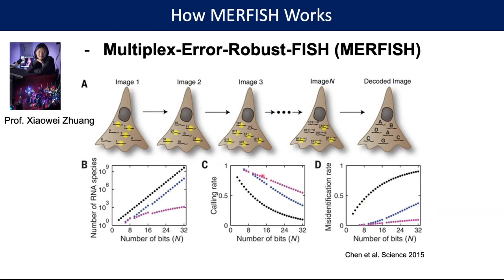So you need to have a mechanism, a design of the codebook, to allow you to really confidently, and with a very low error rate, detect those transcripts at a subcellular resolution. And this was really the innovative part in the recipe to get all of this working, I would say, among lots of other things, of course.